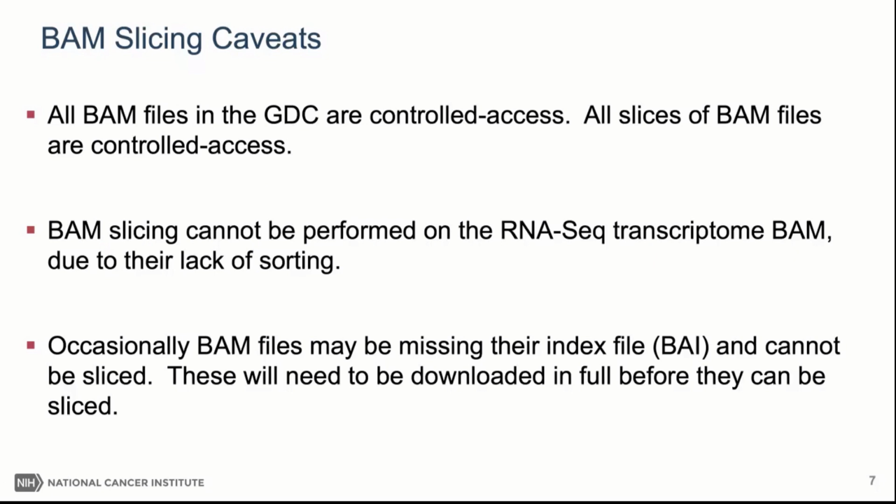Speaking of not having a BAM index file, occasionally the BAM files may be missing their index file. These will need to be downloaded in full before they can be sliced. If you ever do come across these, we keep an eye out for them internally, but if you happen to find one, always feel free to contact the GDC help desk to let us know. That would be very much appreciated.